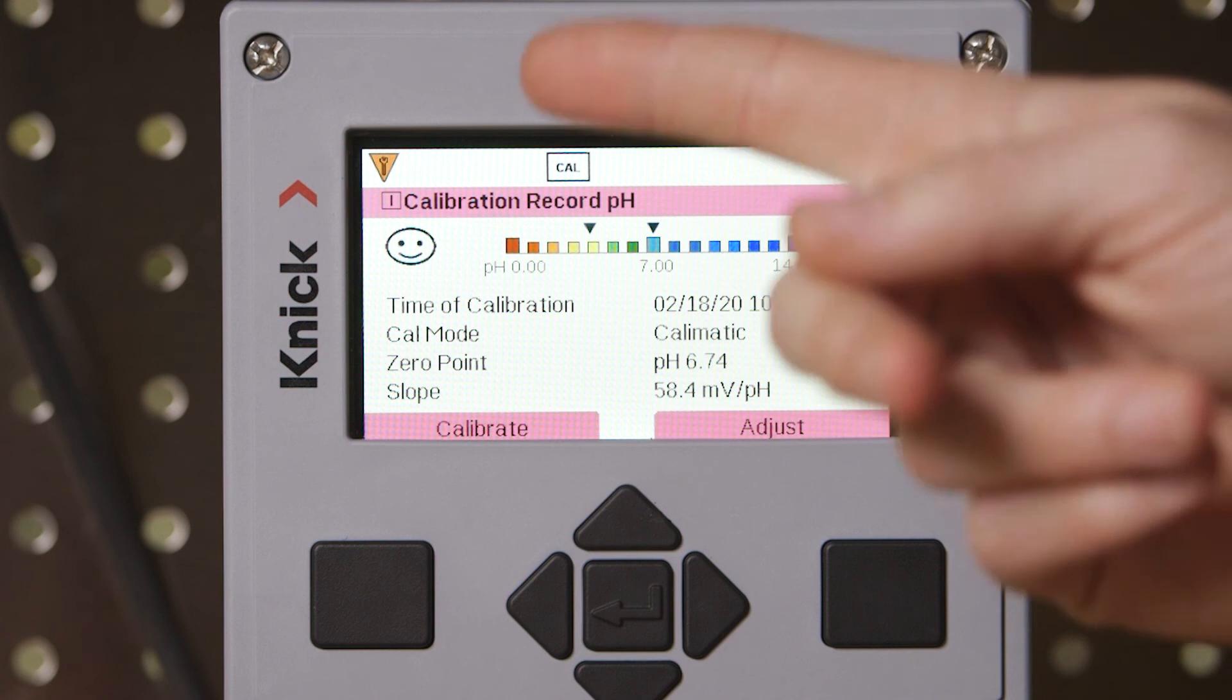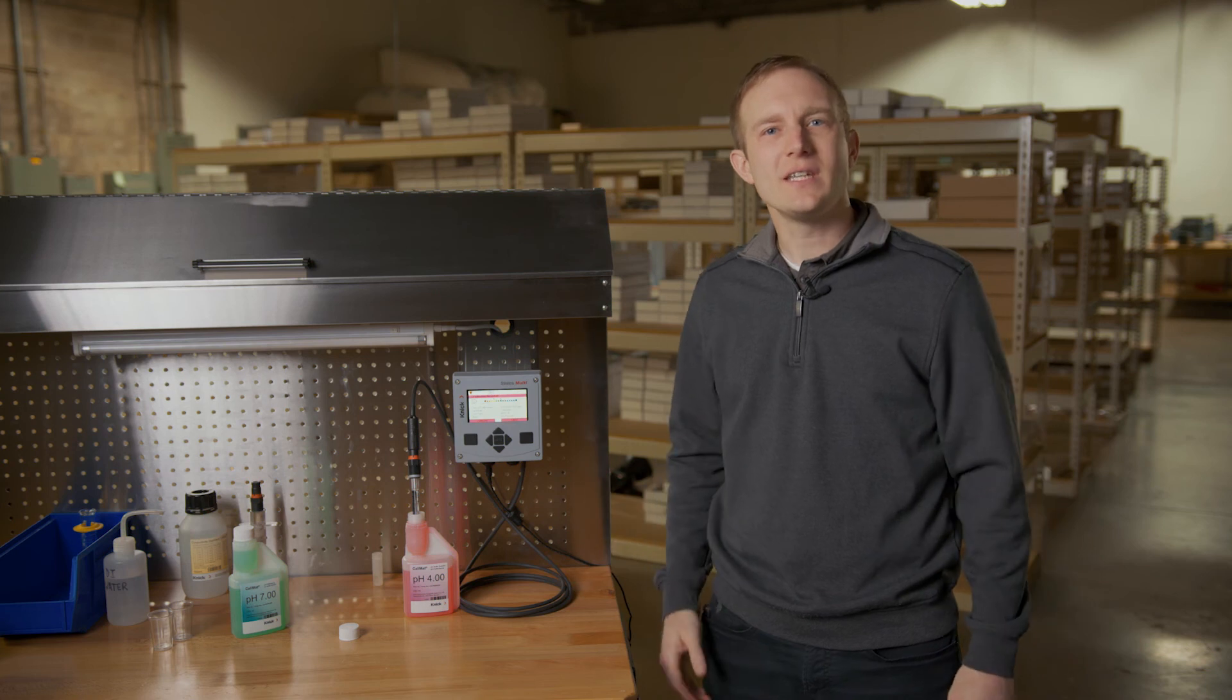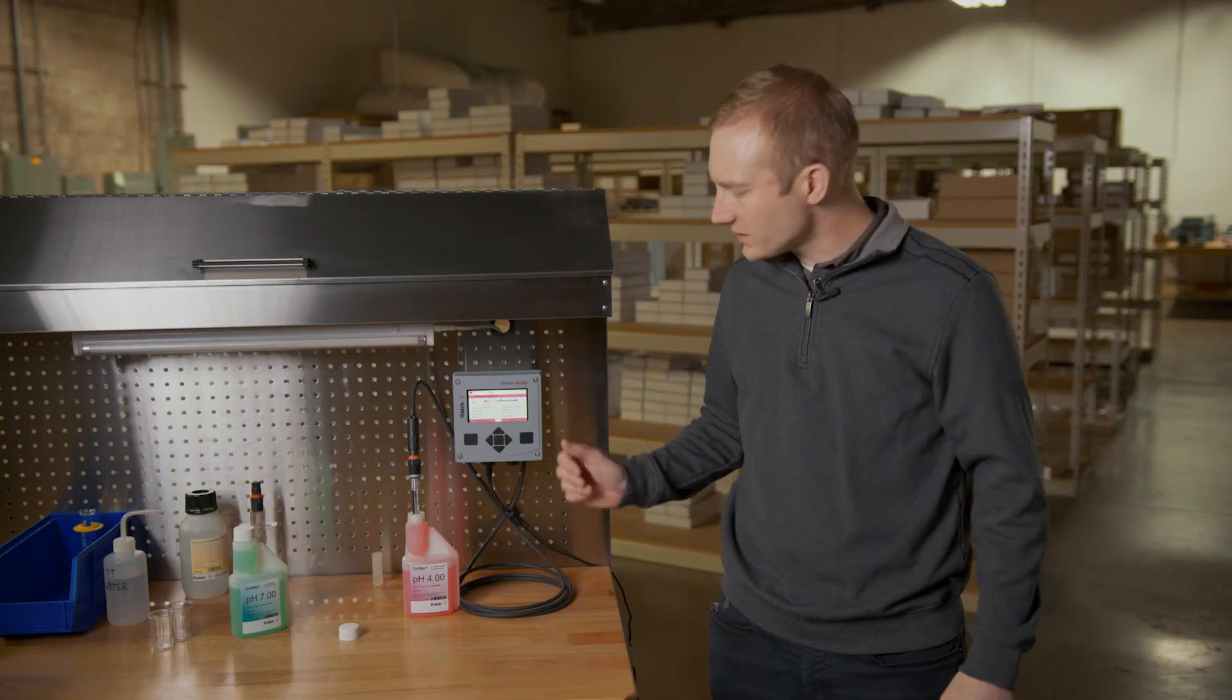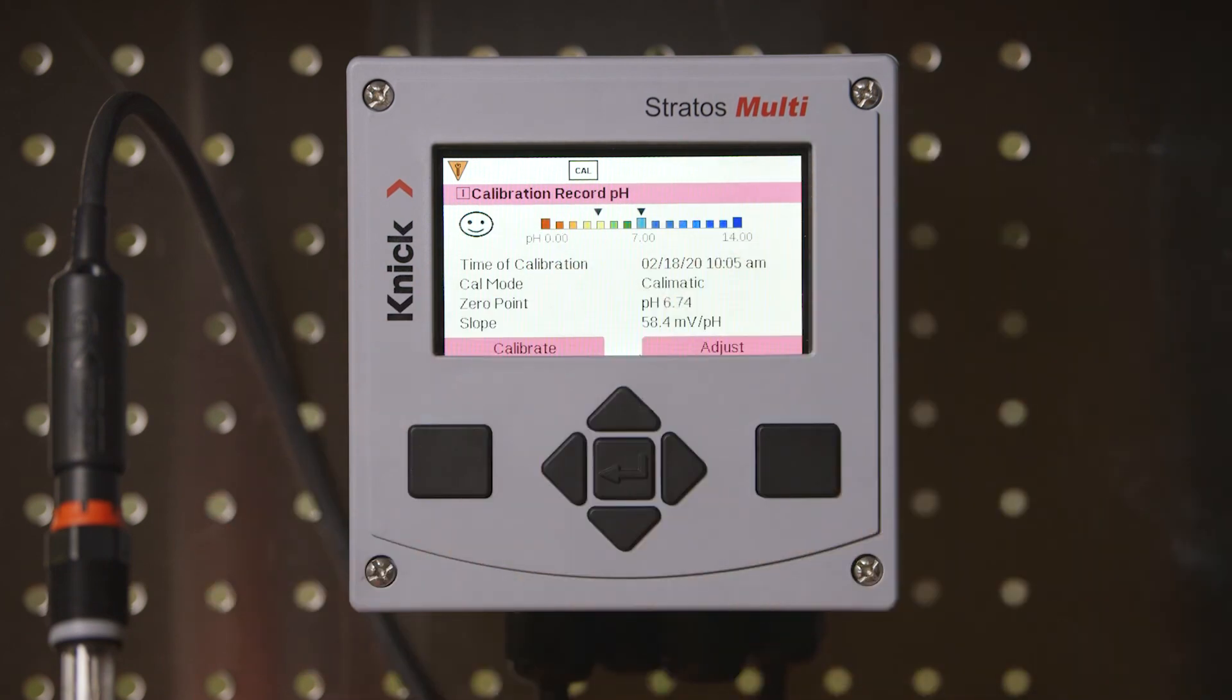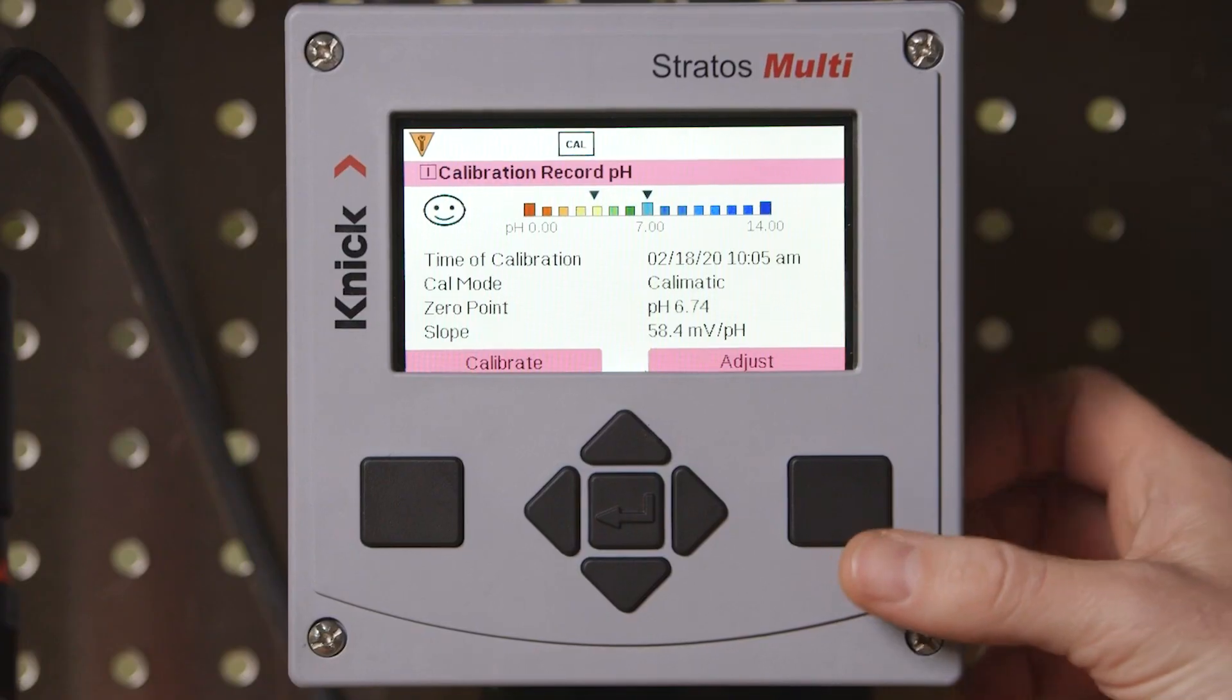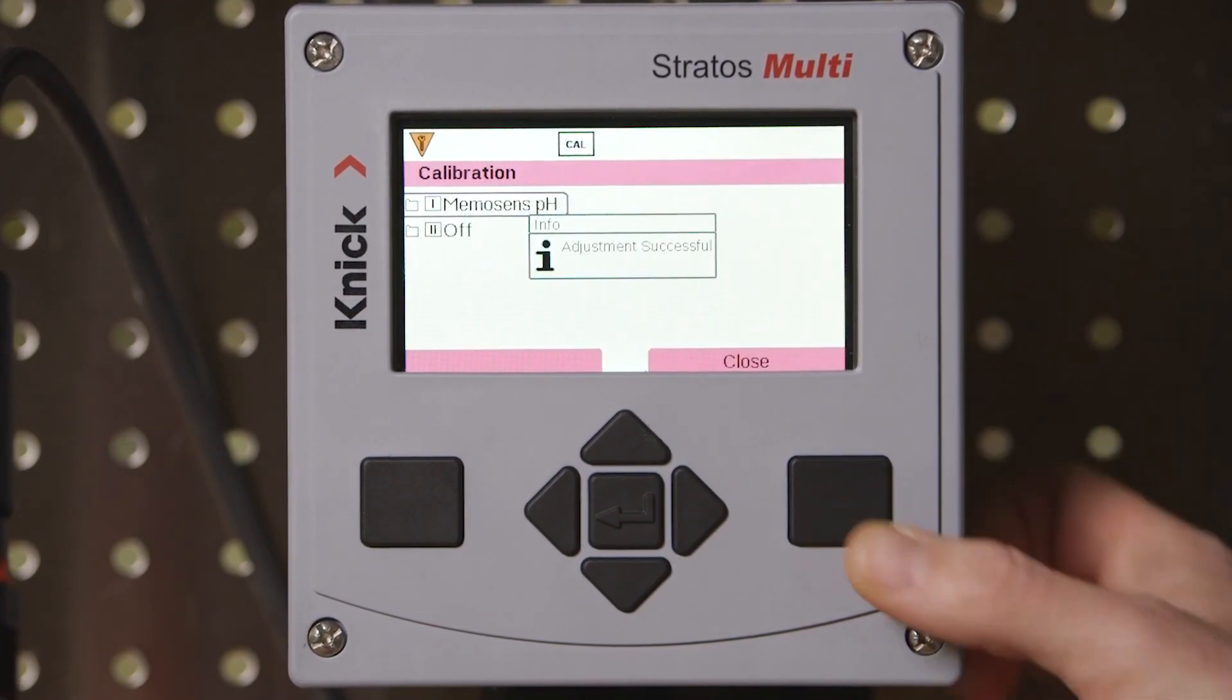Lastly, we have the sensor face icon in the top left corner of our display indicating the status of our calibration. Here you can see we have the opportunity to select either calibrate or adjust. Please note that only by selecting the adjust button will the data be written to the head of the sensor. Selecting calibrate here will not make adjustments to the sensor and will return you to the main calibration screen. We will select the adjust button to make the changes to our sensor and finalize the calibration process.